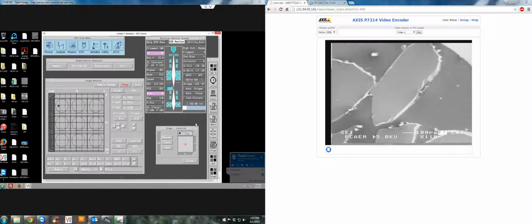One is changing the focus of your electron image, either scanning electron or backscatter. Now, the way to change the focus is, if you're in your probe software under the EOS monitor, click on this right here where it says OL focus.